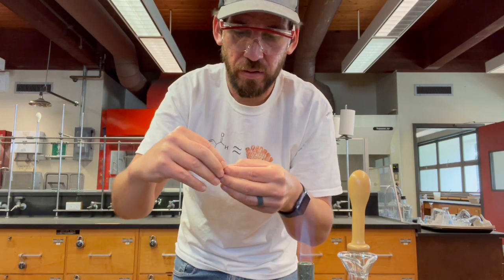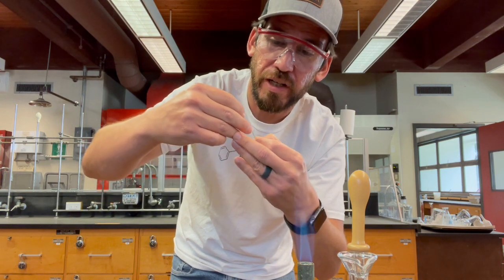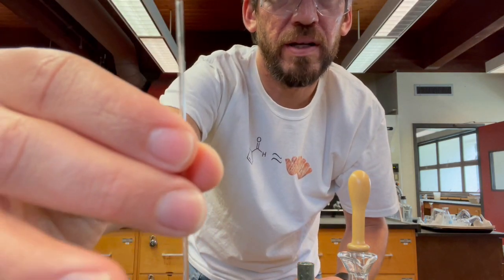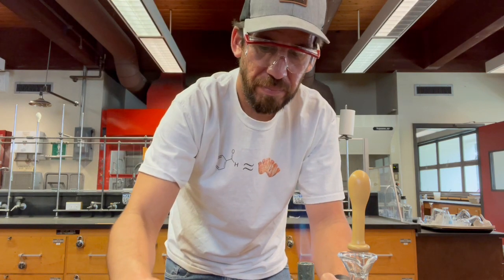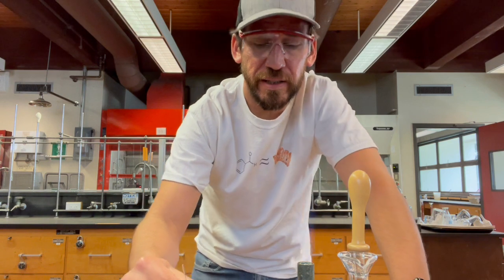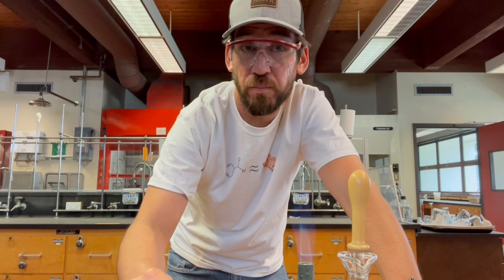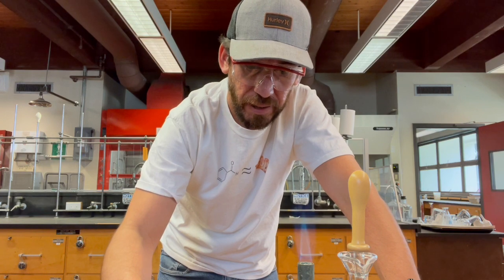Okay. So I used the other piece of that pipette that I already kind of thinned out. You may or may not be able to see it kind of stuck on the top. Should I tap it down and see what happens? Okay. So now what we want to do after this is take this to the melting point apparatus and test, and then basically see what the boiling point is. And so the boiling point, I'll explain as we're doing.